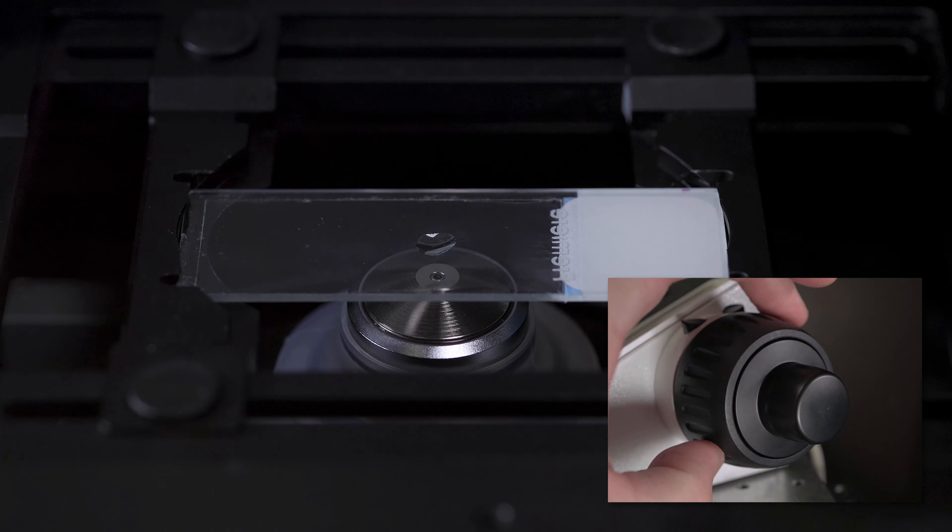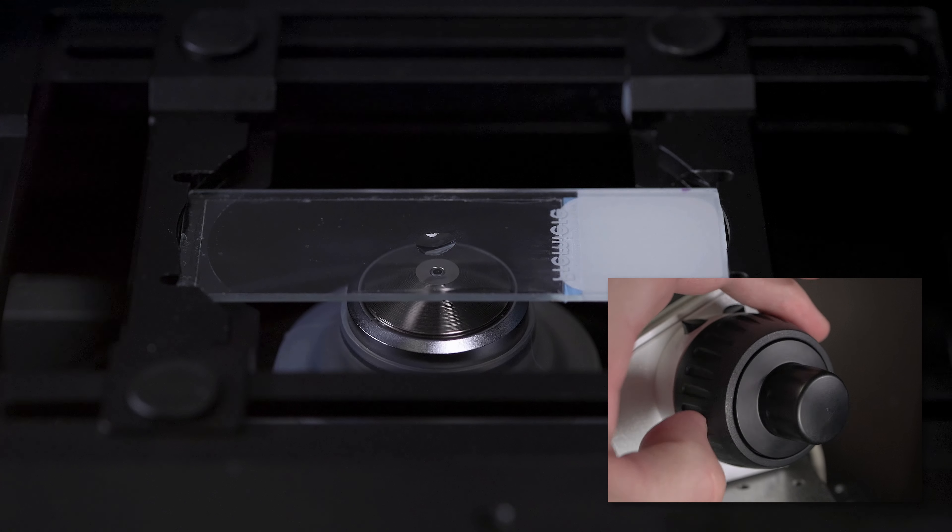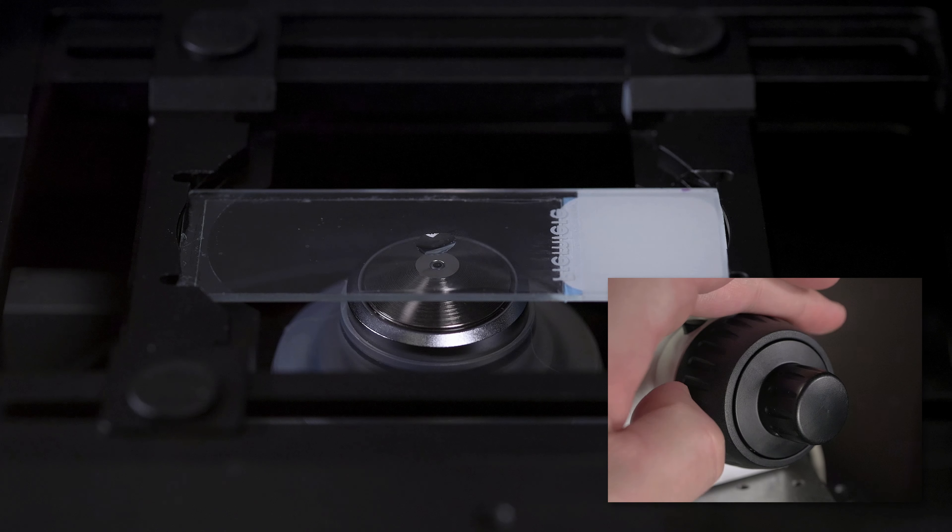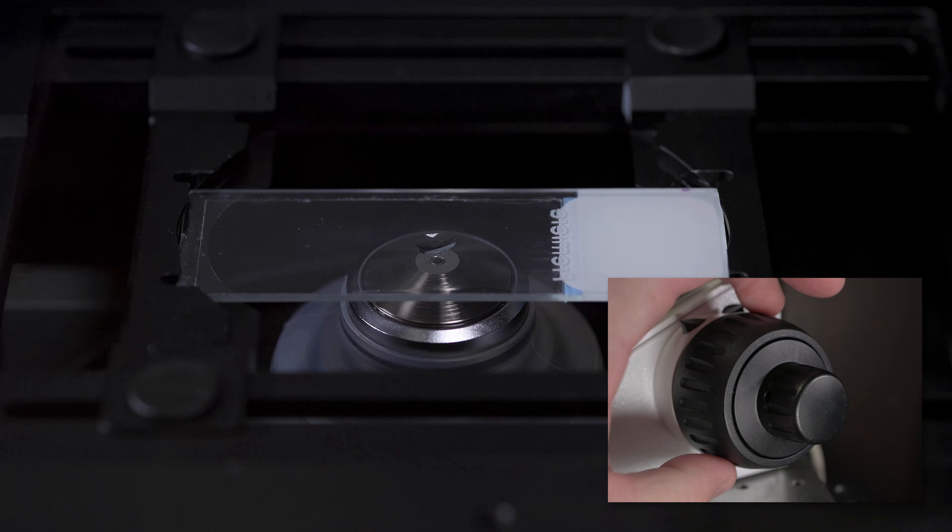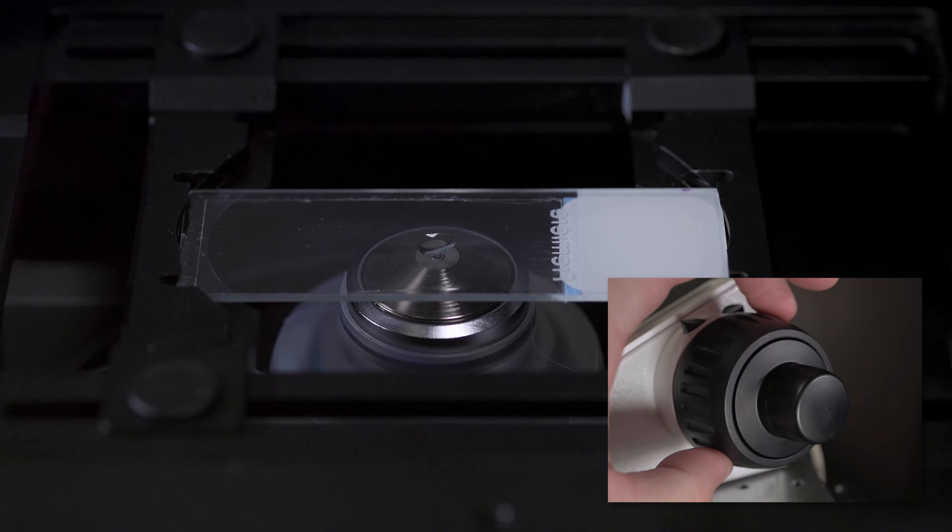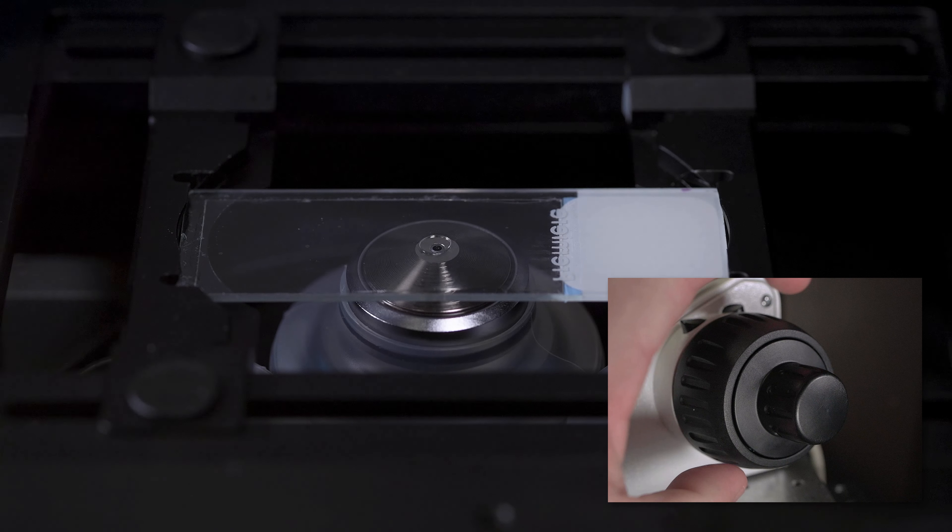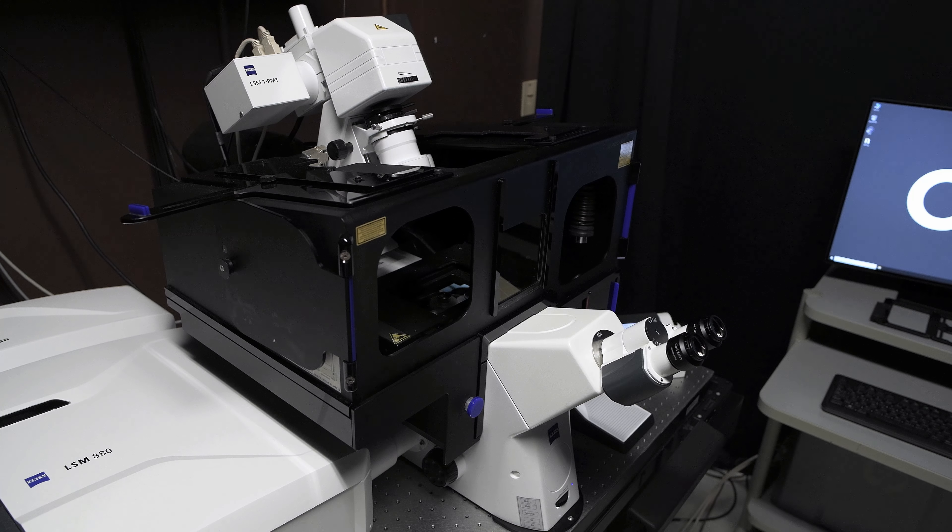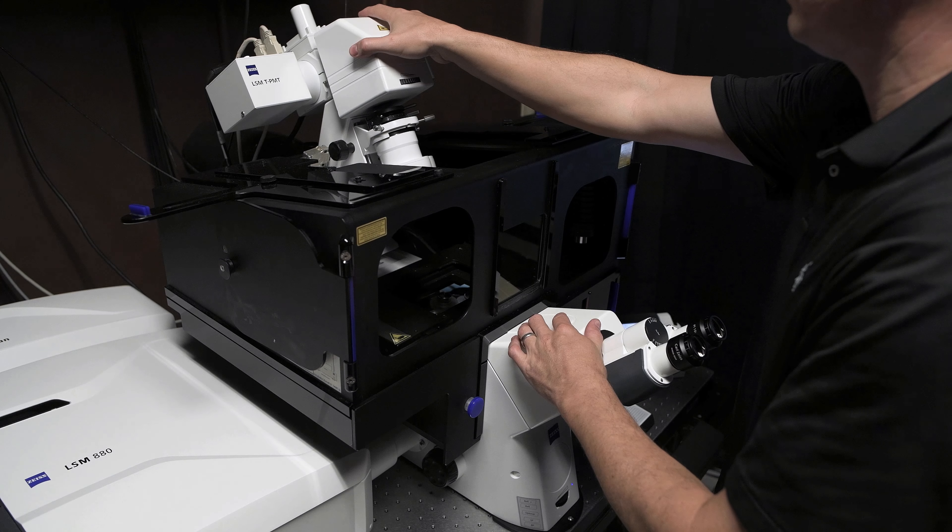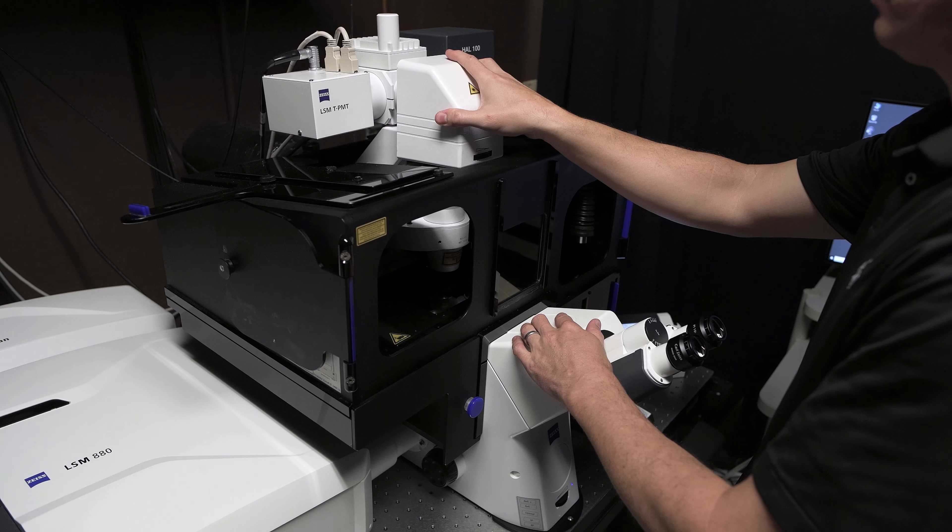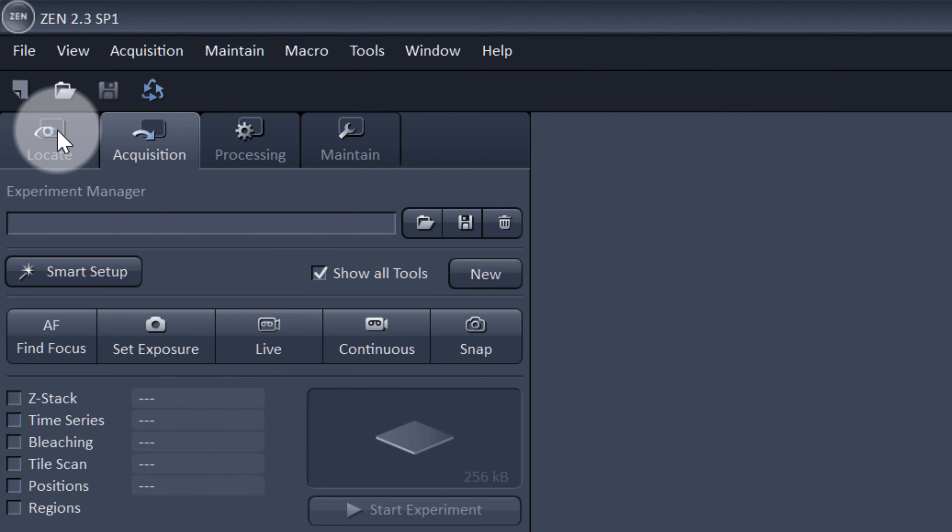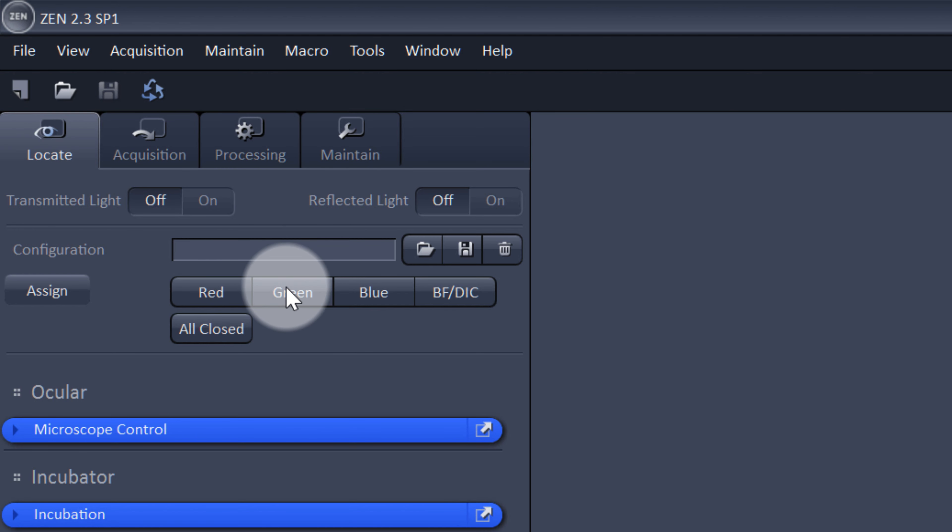In this case, you can see the bead of oil on the slide. Begin rotating the coarse focus knob towards the microscope to bring the objective closer to the specimen. While observing the bead of oil on the slide, continue focusing up until you see the oil just touch the objective lens. When you see the oil touch the objective, immediately stop focusing. Now we can move the transmitted arm back down and begin visualizing our sample in the eyepieces of the microscope. Navigate to the locate tab in the Zen software and turn on the epifluorescence channel you wish to use for focusing, as instructed in our previous training videos.